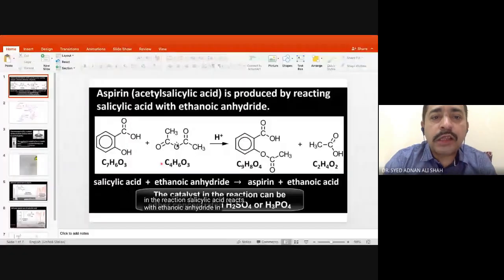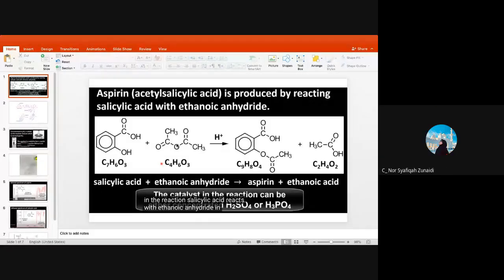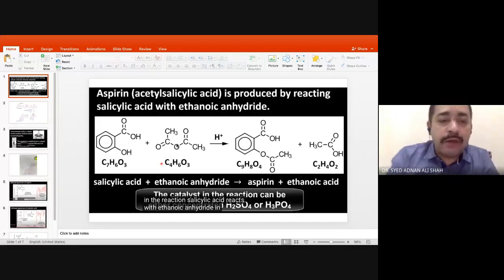So can you all see my slide? Yes. Yeah. So now you will understand better, right? So I will go step by step, so that will be easier for you, how the synthesis of aspirin occurs. Then I will let you know what are the important components.